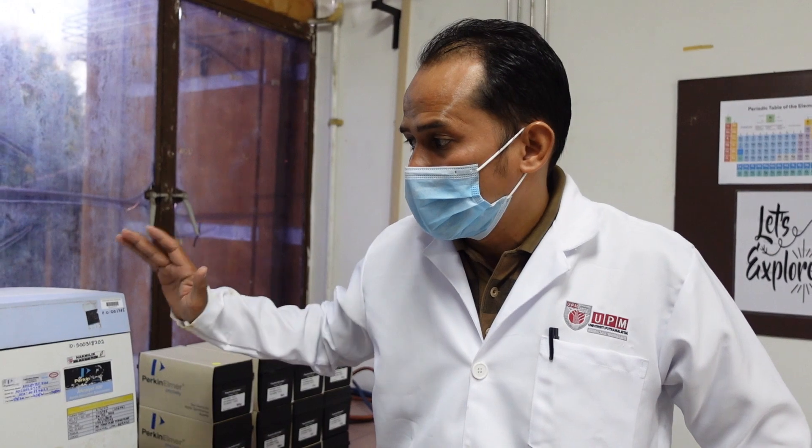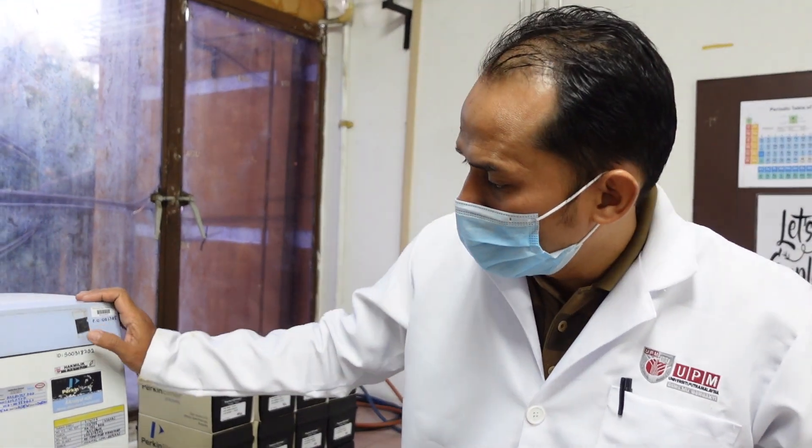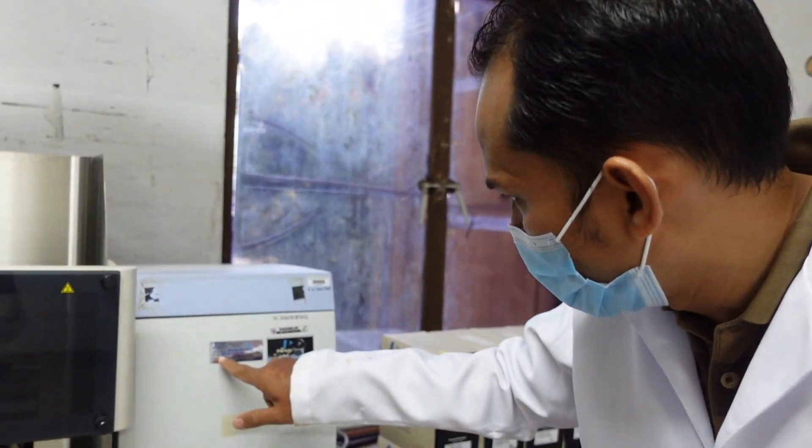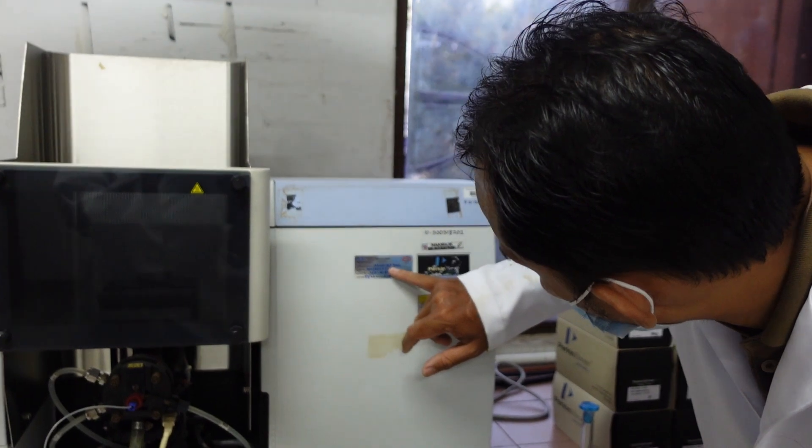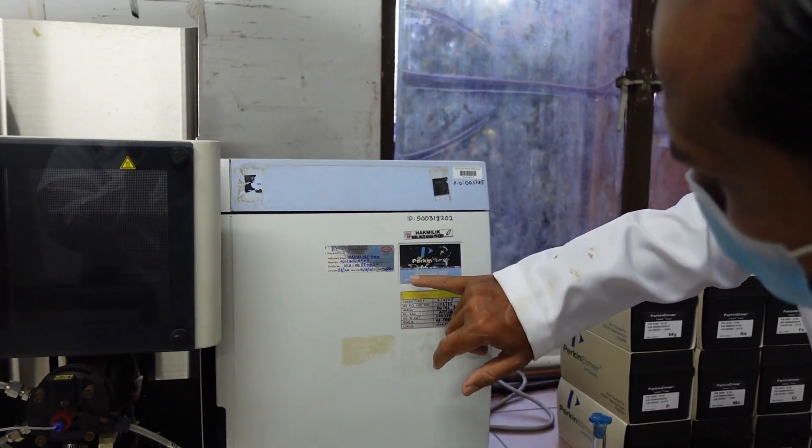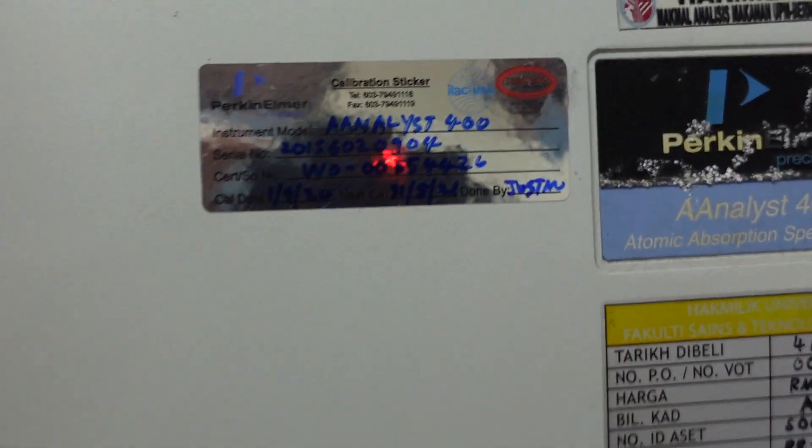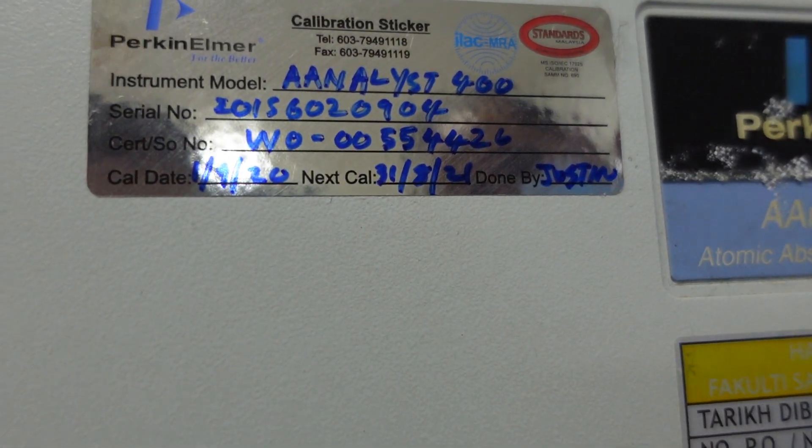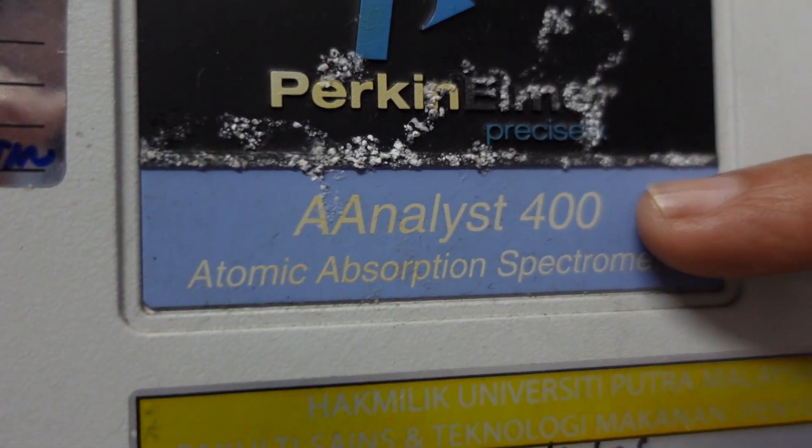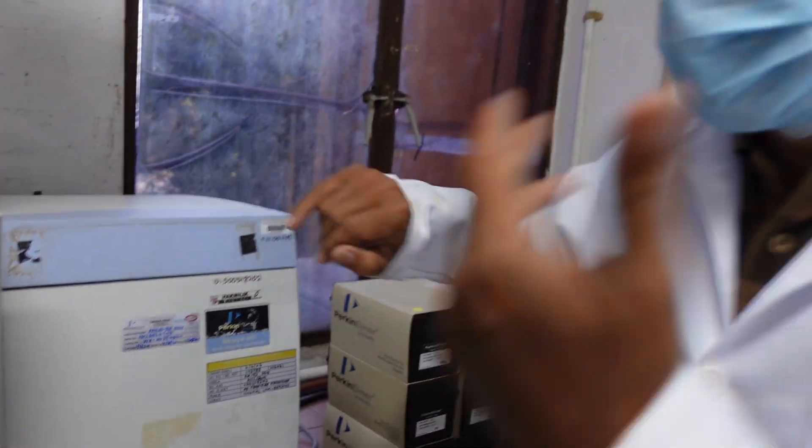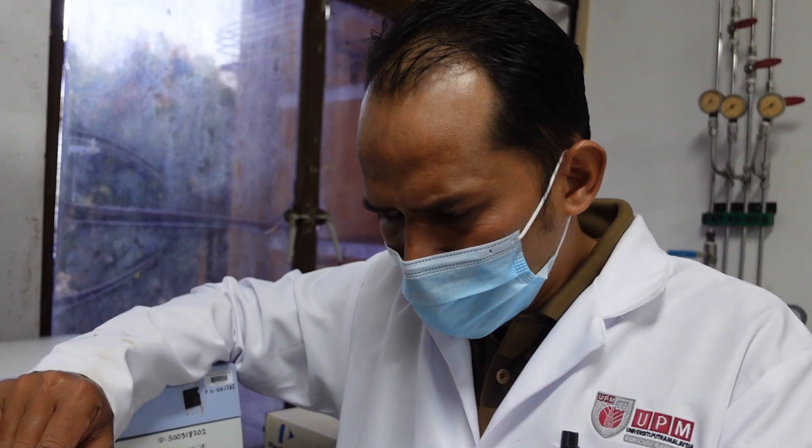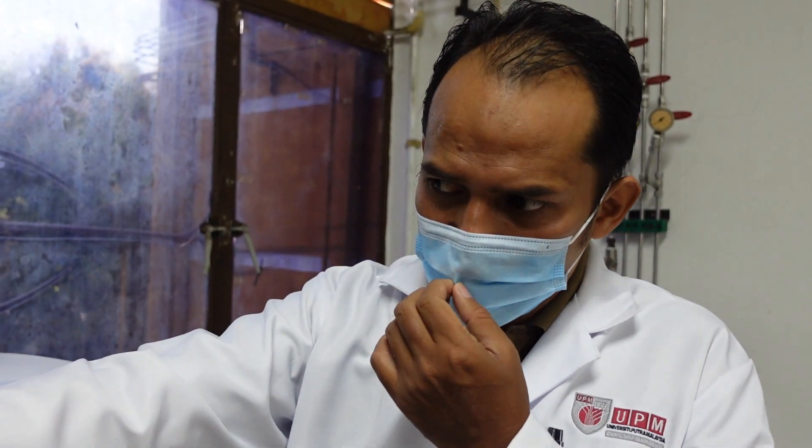Let me show you the AAS that we have in Food Science. We are going to use AAS from PerkinElmer. The model is AAnalyst 400. There are many models. Each model will come with slightly different setup and the interface will be different. If you have a different model AAS, you might want to go to the manual to see how it's run. But the basic is the same.